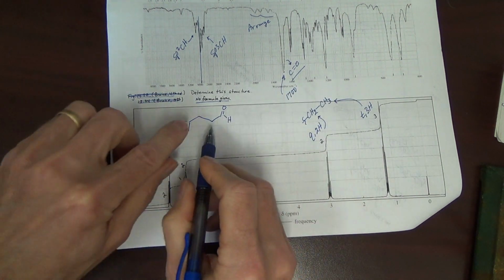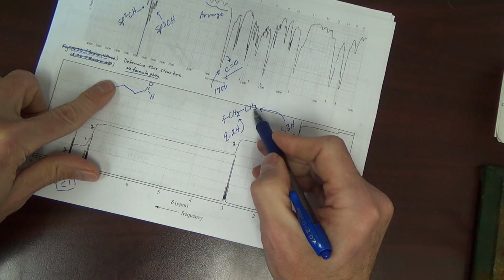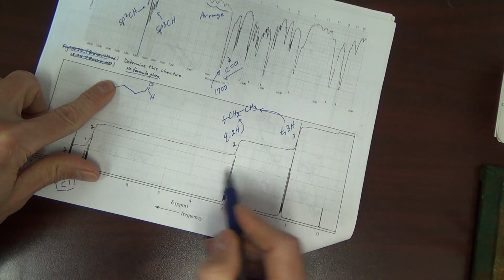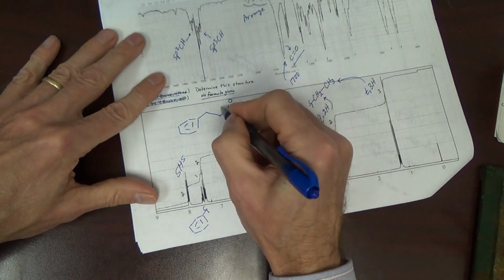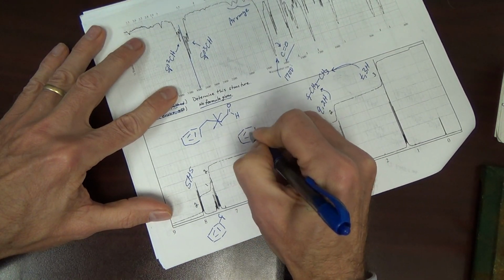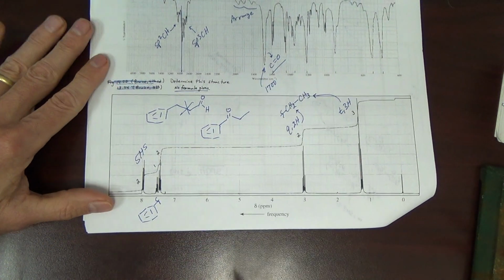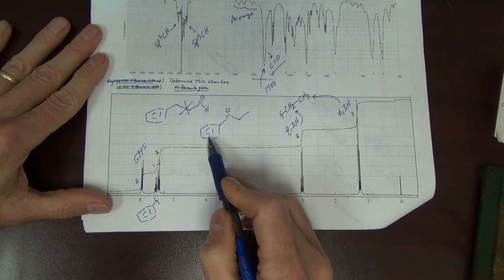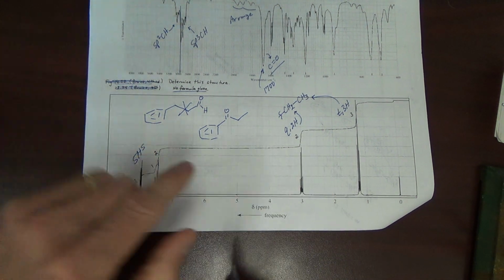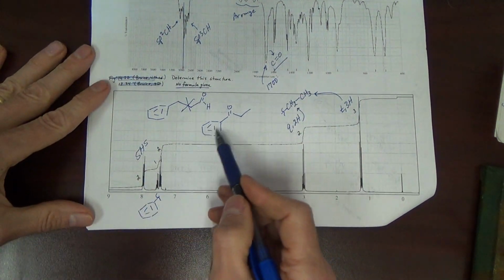And if we add something there, this is no longer CH2, CH3. If you take an H away from here, this no longer matches. The answer here is to slip the carbonyl in between the benzene ring and the ethyl group. We maintain the ethyl. With the carbonyl, we maintain this fragment.